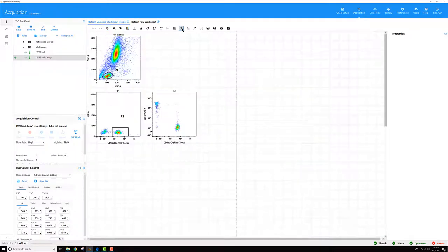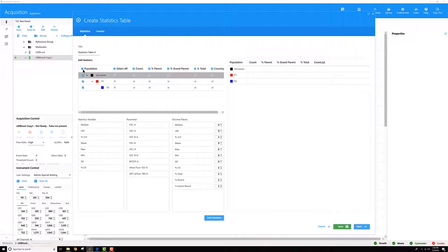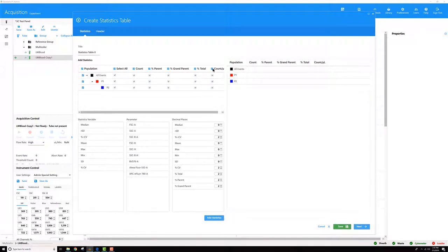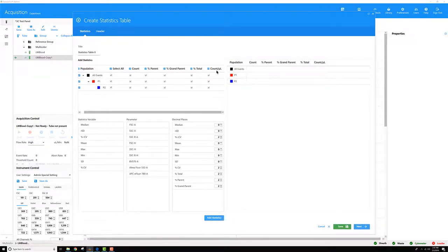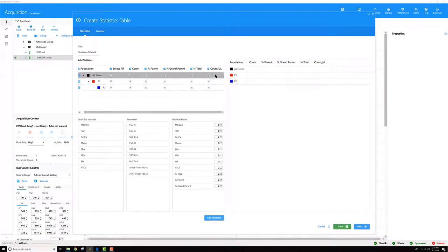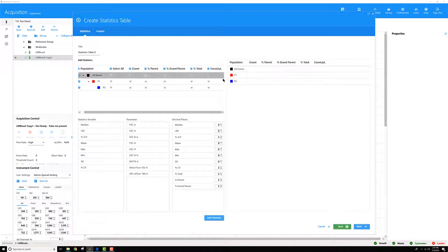The software can do this automatically for you. You can create a statistics table. You'll see this last item here is count per microliter. But keep in mind, this is the count per microliter that was recorded in your prepared sample. So if you have any dilution factors, you'll need to add those in on your own.